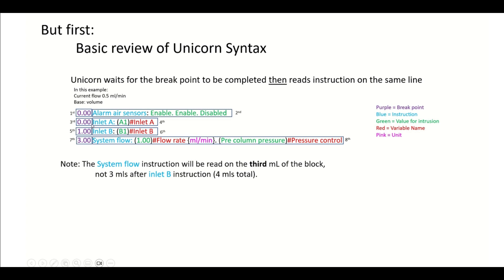Then because it says zero here again, unicorn is just going to not even notice it and read the inlet A instruction for the fourth little bit. Then after that, it's going to see this one here. So that's the first mil it's going to wait for. It's going to wait for two minutes because we're going at 0.5 mils a minute and the base is volume. After it's gone for those two minutes and completed that first mil, it will read this inlet B instruction, which is the sixth little bit of the method.